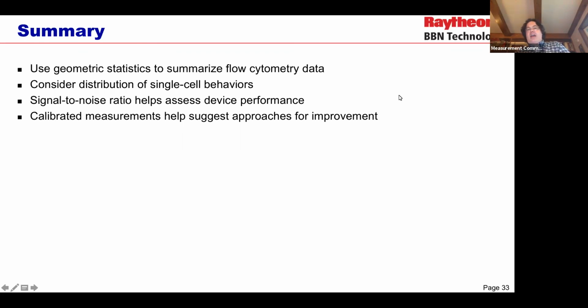And second question from Hassan is, if I understood you, mostly you were interested in the area, not the height or the width? That is correct. In fact, it's not just iGEM projects. Most projects, usually if we're interested in fluorescence, we're usually interested in the area and not the height or the width. And the height and the width are used mostly for gating. I have seen exceptions. So like, for example, when somebody was studying a cell killing process, they really wanted to look at the other things too, because they wanted to actually study the debris itself directly.